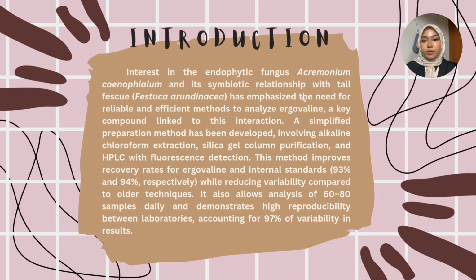Hi, my name is Kasih Aina Shazana binti Muhammad Nazri, and now I will present the introduction. The introduction is about the interest in the endophytic fungus Acremonium coenophialum and its symbiotic relationship with tall fescue, Festuca arundinacea, which has emphasized the need for a reliable and efficient method to analyze ergovaline, a key compound linked to this interaction.